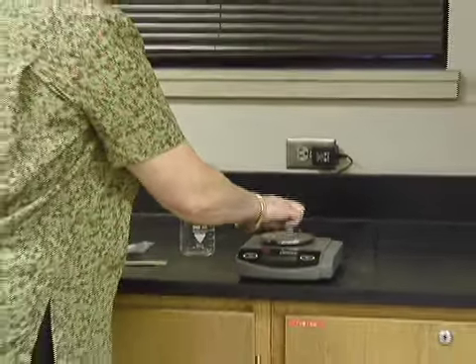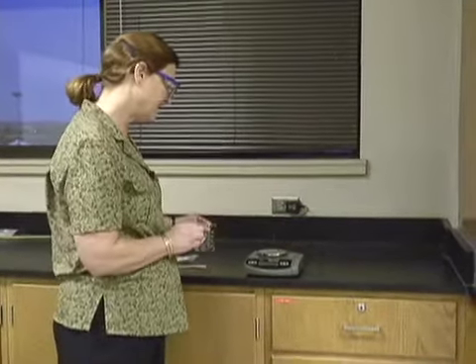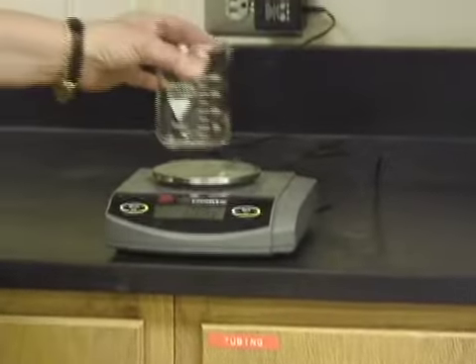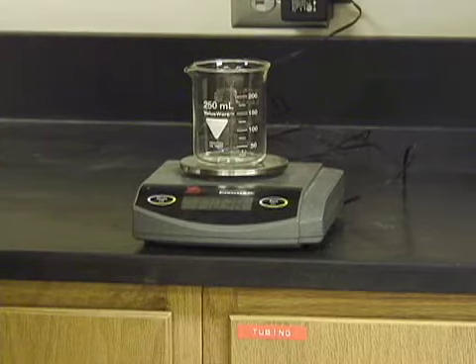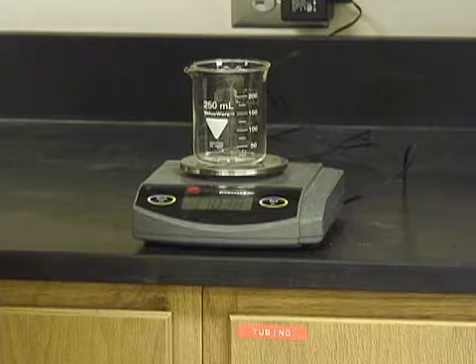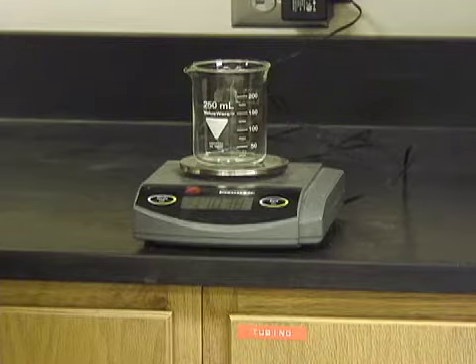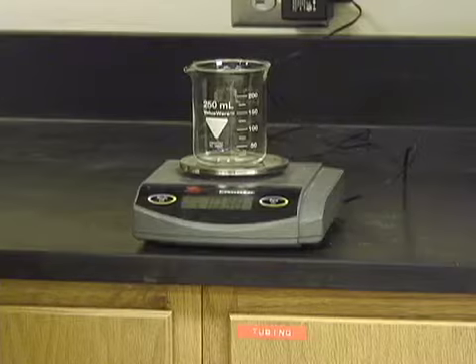Now I also need the mass of my beaker, and I want to make sure that it goes back to 0, and then I will put my beaker in the middle of the pan, and that is 110.38 grams. 110.38 grams. That is the mass of the beaker.